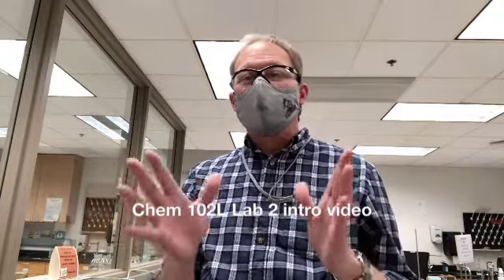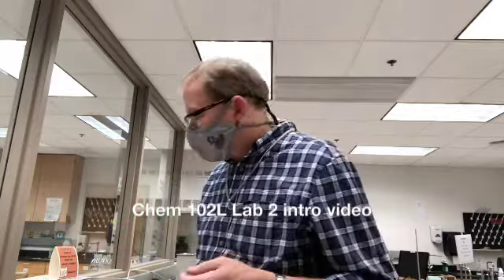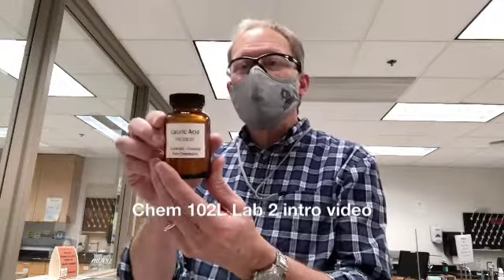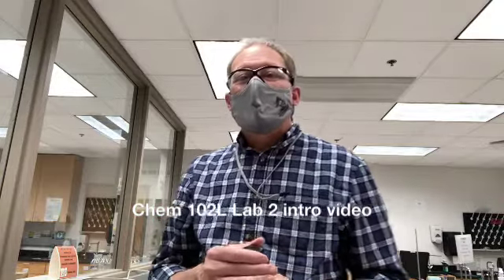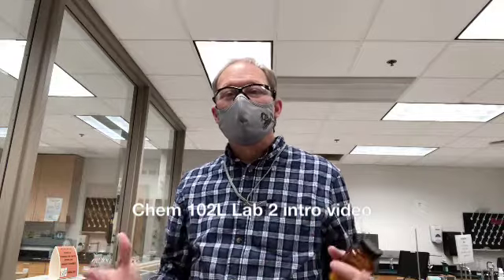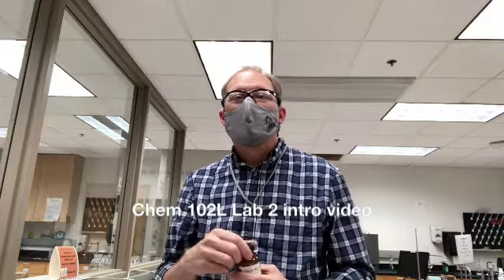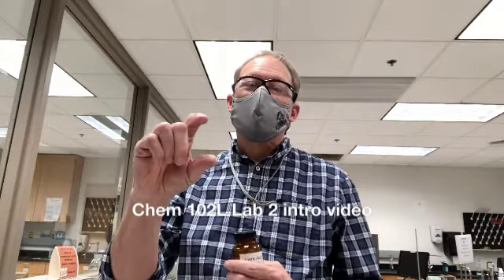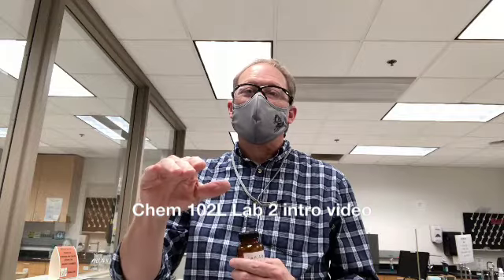a phase diagram for a pure substance. And we will be measuring a freezing point of a pure substance, and that's going to be lauric acid. And then we're going to make a mixture and see how much that freezing point changes. And that discussion happens to do with where you're talking in class about making up solutions and the properties of solutions, and even colligative properties, where placing a certain amount of a substance in a mixture will create a certain amount of change in the temperature, which is a freezing point depression, or a lowering of the freezing point.